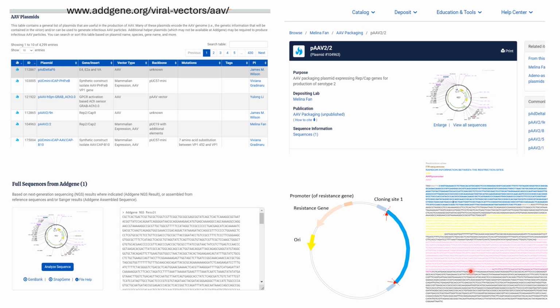I have to say that there are many other text editors, for example, text editors that are specific for DNA, and this will be much easier. In Word, it's very easy, and it's even easier using these DNA text editors. Okay, so the only thing that we have done is looking for the plasmid, getting the sequence, and highlighting the different parts. So now we have the backbone here and the sequence and everything highlighted. So let's go for the next step.